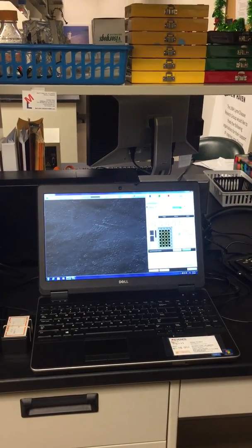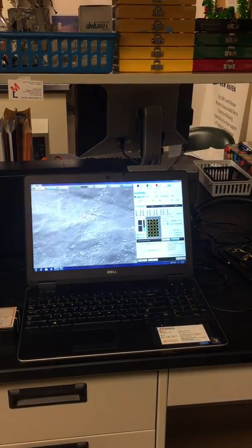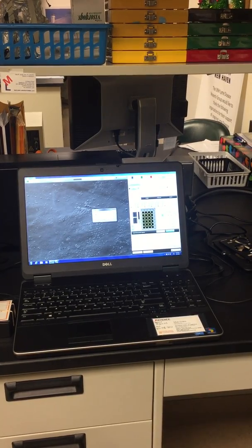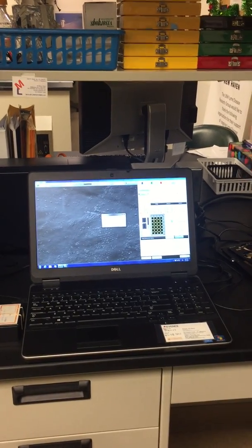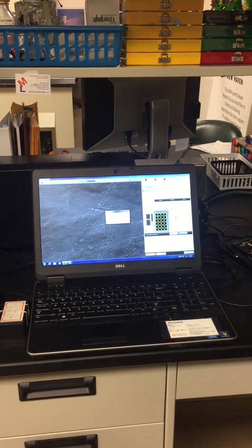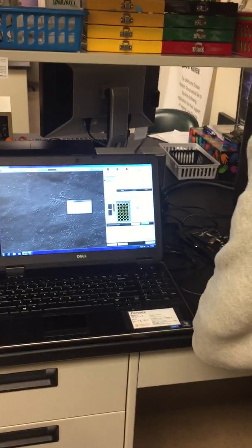Bright field, you can adjust the resolution of it, brighten this up a little bit, set your exposure and everything. And then basically all you're going to have to do, in the 24 well plate, is there multiple wound assays that you're going to be looking at? Or will each well just have one? So you're going to want to have multi-point selected.